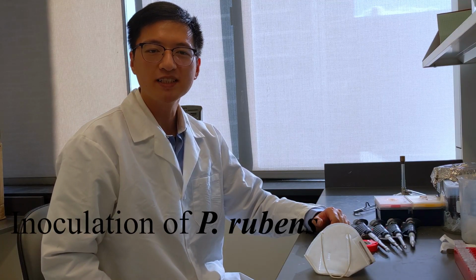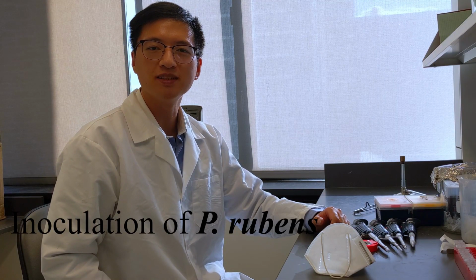It won't be so easy to get a Penicillium rubens strain just by leaving an uncovered plate by the window, which is how Fleming obtained his strain. So we decided to buy a commercially available penicillin-producing mold. Once we obtain an agar plate with P. rubens, we can inoculate a second agar plate. Here's how we do it.